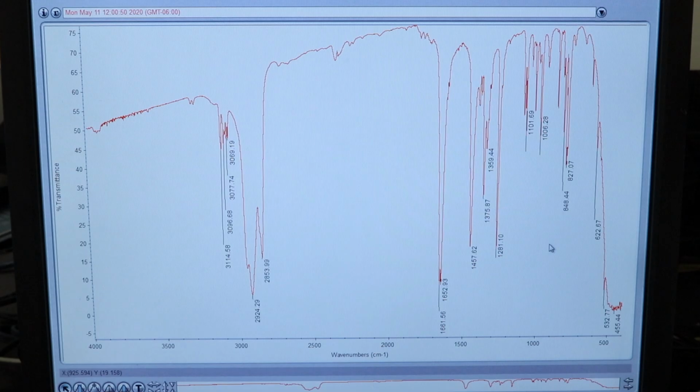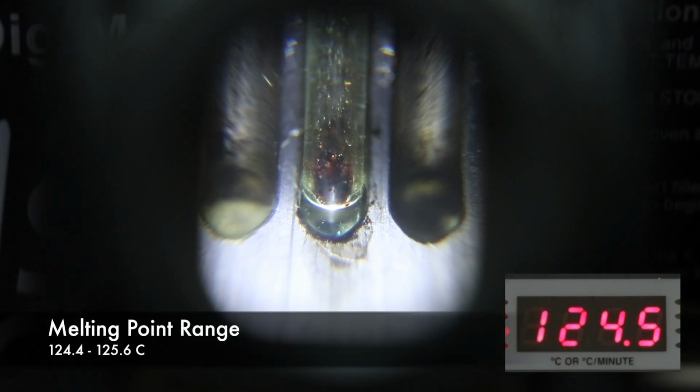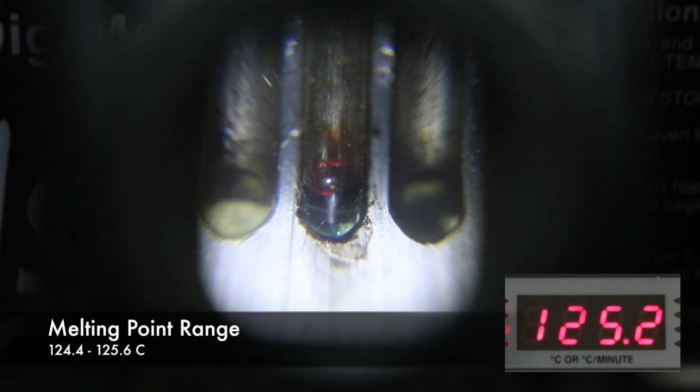Now the IR for the di product isn't going to be very different from this at all because it's going to have the same functional groups on the molecule, so the melting point is what's really going to help us distinguish the two. So let's go ahead and take that melting point, starting a few degrees lower as usual just in case. But this compound doesn't start melting until about 124.4 degrees Celsius and doesn't finish until 125.6. So a little bit lower than expected, but that's not too bad.